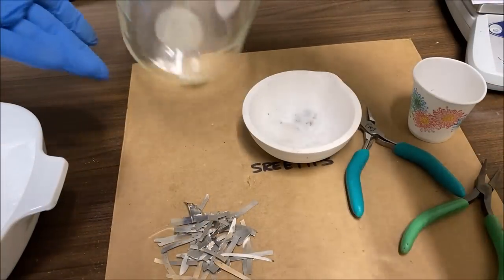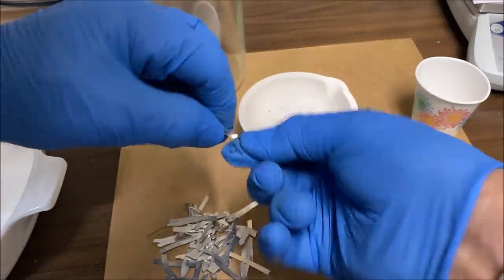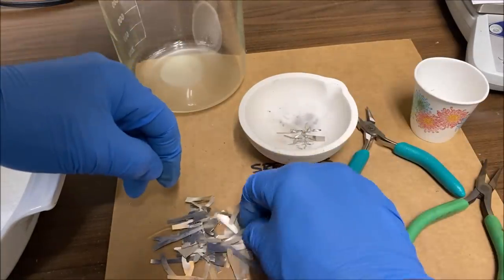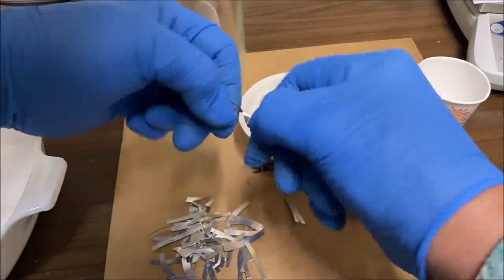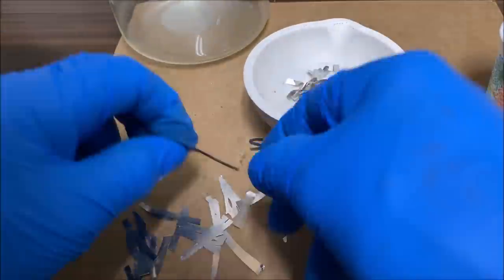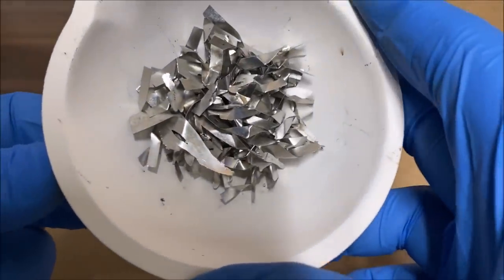I almost forgot. We need to pour the metal into this unglazed melt dish. And then what we're going to do is twist all these little pieces that we've cut up and add those to the melt dish. And the reason we're doing this is so that the pieces don't lay flat on the bottom of the reaction beaker. Here we go, we've got everything twisted up.